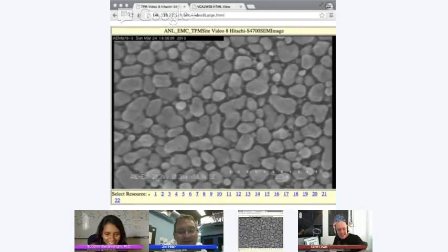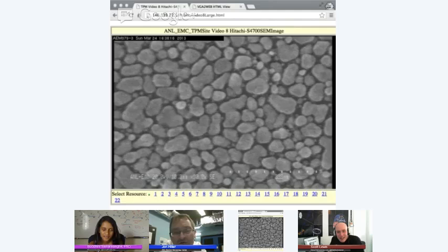level. Yeah. Each one of those grains is probably 100 or so nanometers, but you can see there's even smaller ones in between. Now, believe me when I tell you we can even go to higher magnification. The magnification right now is 90,000 times. Jeez. The problem that we have here is that every time I talk, the vibration from me speaking is affecting the resolution of the microscope.